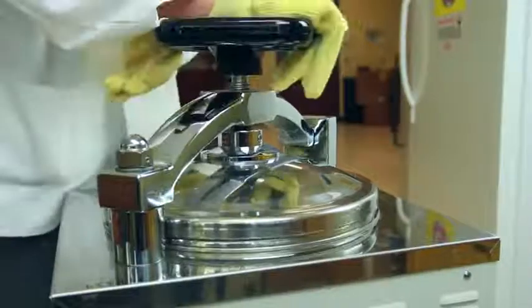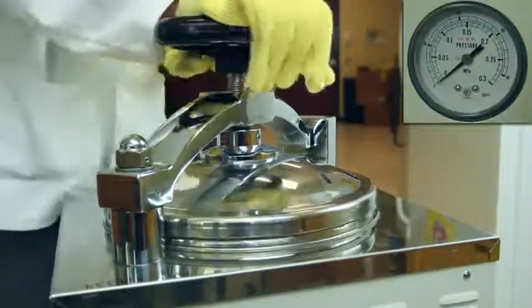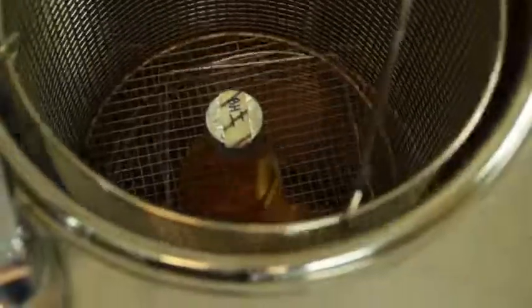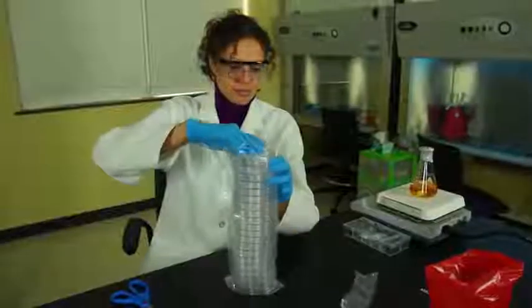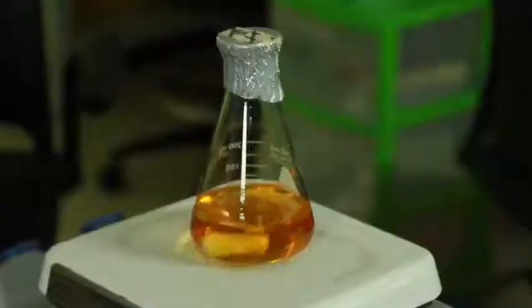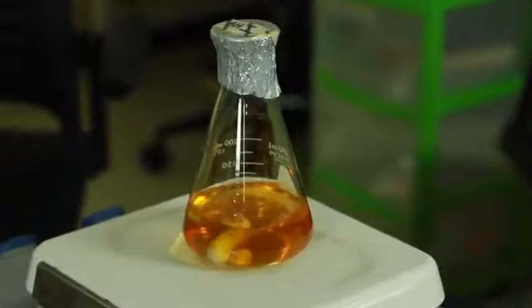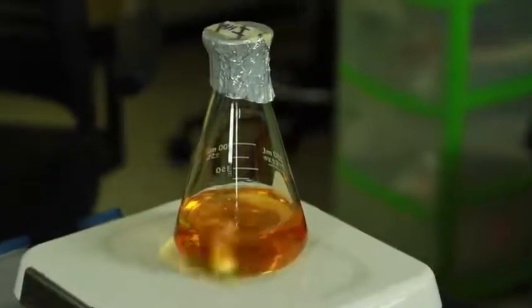While it's running, enter the date and time and the operation details in the log and initial. Once the cycle ends and the pressure gauge reads 0 psi, use heat-resistant gloves to slowly open the lid and remove the sterilized flask. Back at the bench, place the flask onto the stir plate and stir the media very gently and allow it to cool to about 45 degrees Celsius.